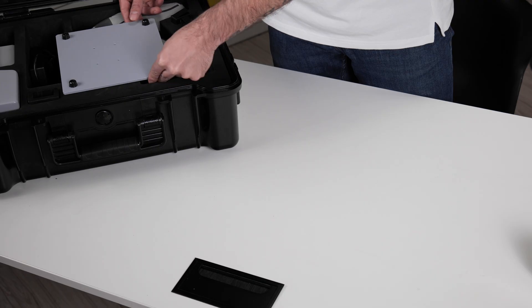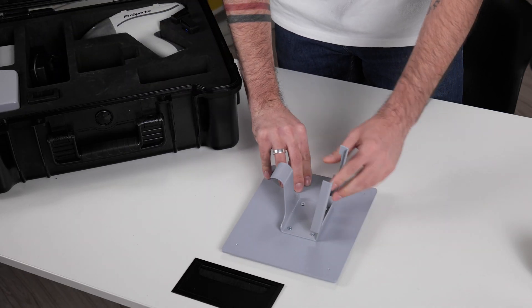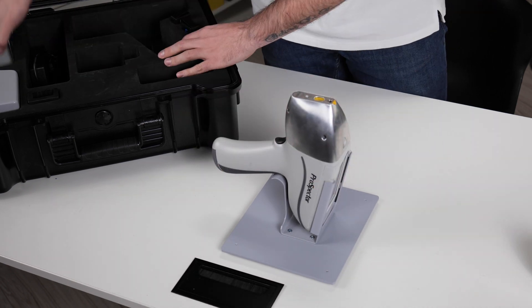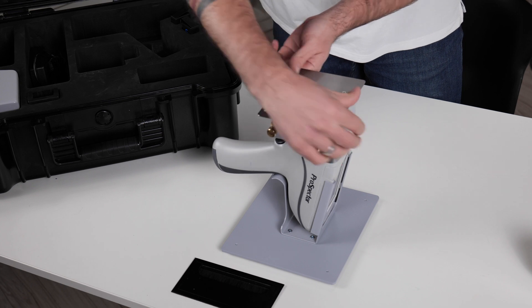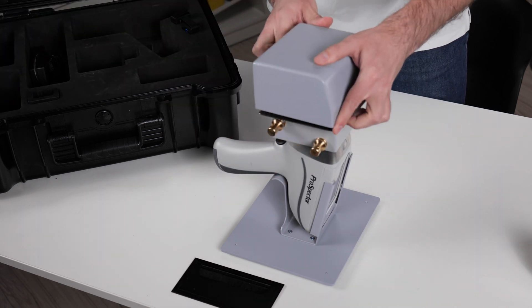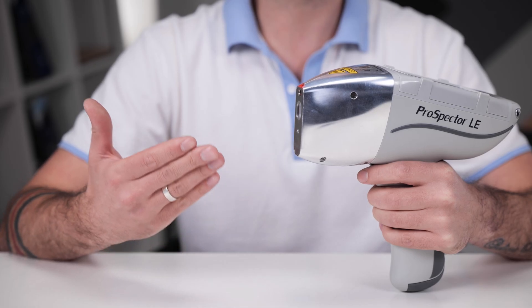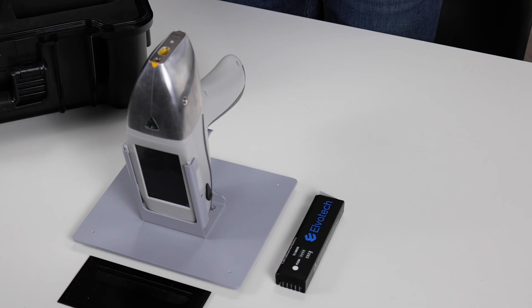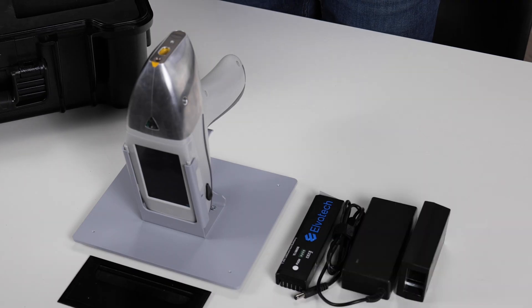Now let's get to the most exciting part. The Prospector 2 comes with everything you need to perform accurate and reliable analysis. It includes a special laboratory stand, which is my personal favorite feature — this option transforms your spectrometer from portable to benchtop in just several seconds. Also included are the analyzer itself and main components such as the battery, charger, and test samples.